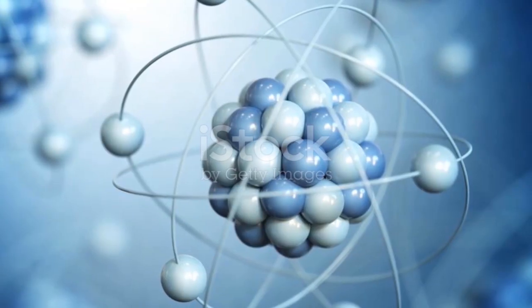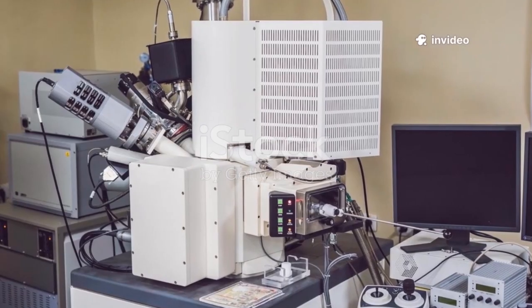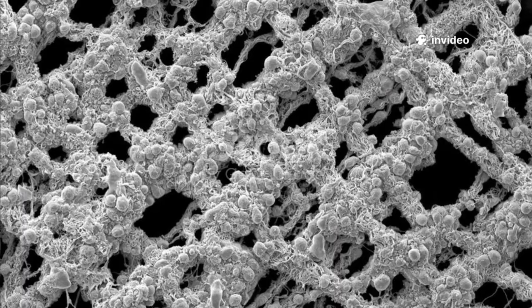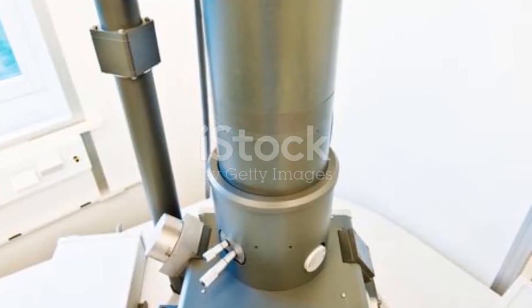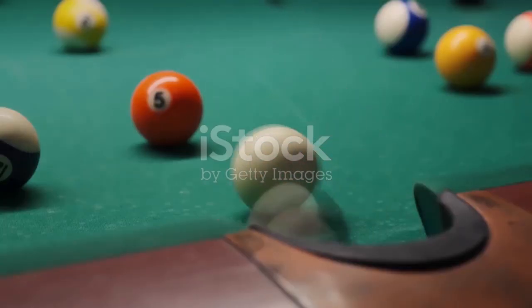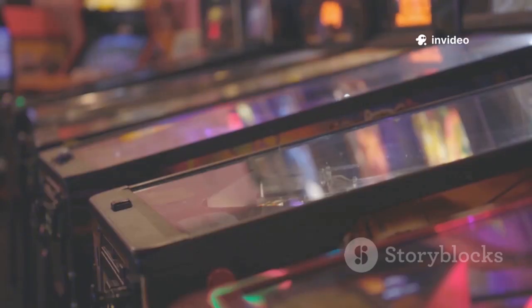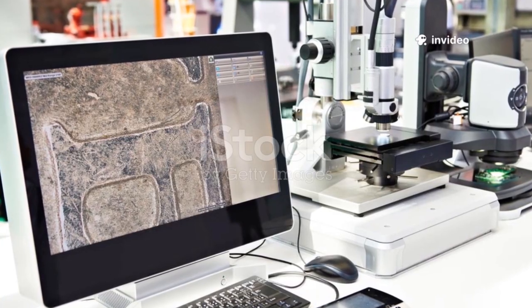As these electrons hit the surface, they bounce off in all sorts of ways. Some electrons scatter, some knock loose even tinier electrons from the sample. And these escaping electrons are what the microscope actually detects. Think of it as a digital game of billiards, with electrons ricocheting everywhere. Next, detectors gather all these signals and translate them into a crisp black and white image.